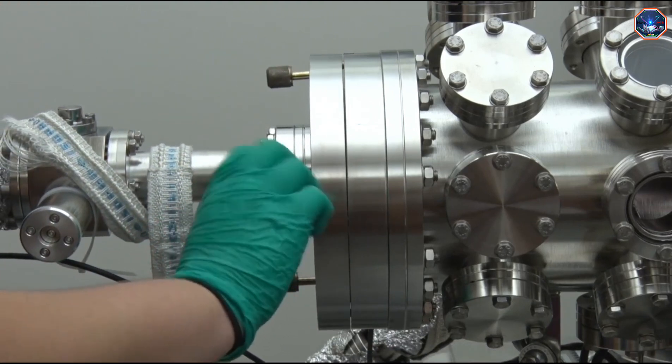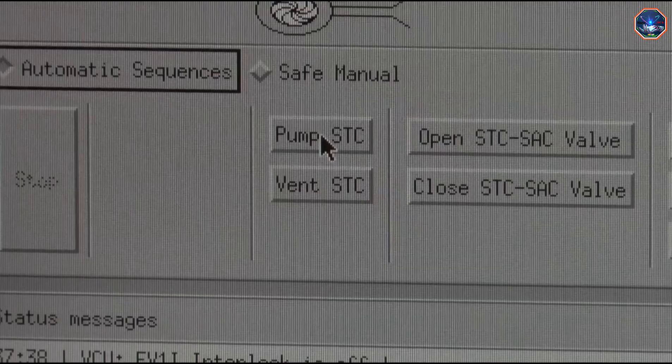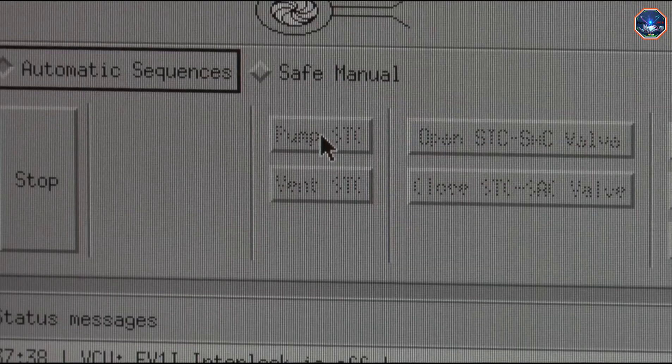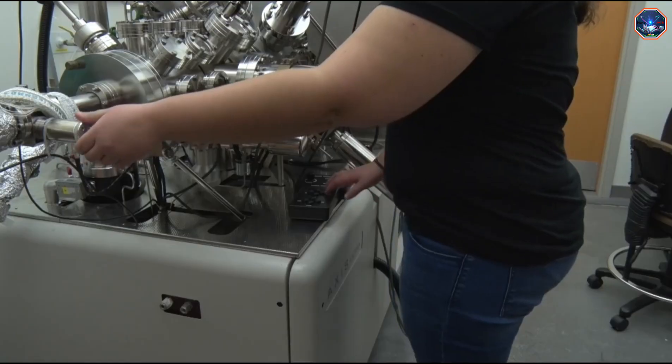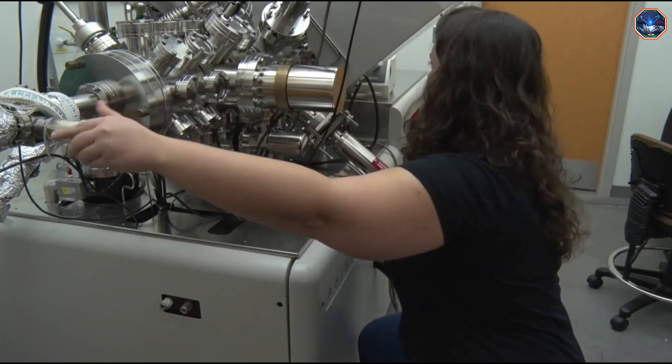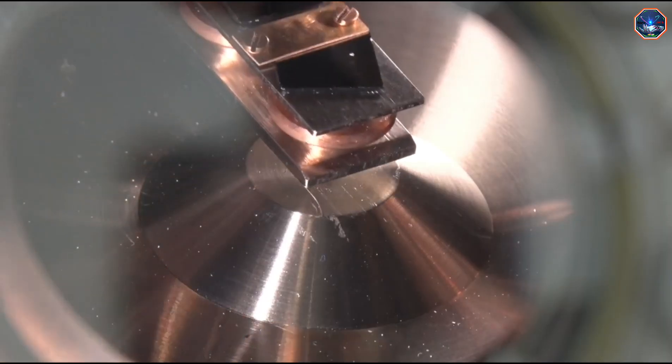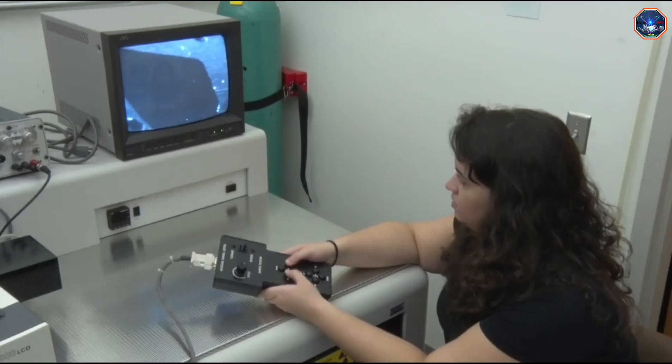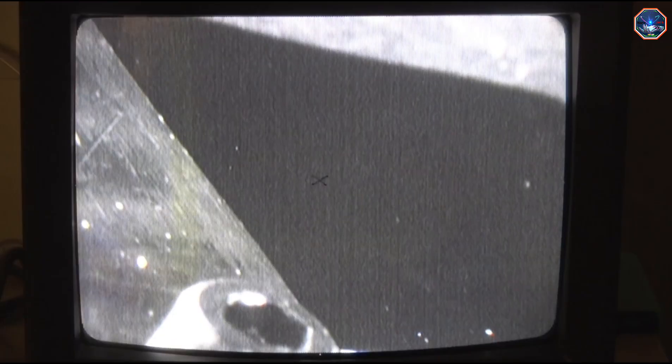Depending on the size of the chamber that needs to pump down, this can take anywhere from 20 minutes to 2 hours. Once the chamber has pumped down, I can move the samples into the analysis chamber, turn on the X-rays, and find the spot on my sample that I want to analyze.